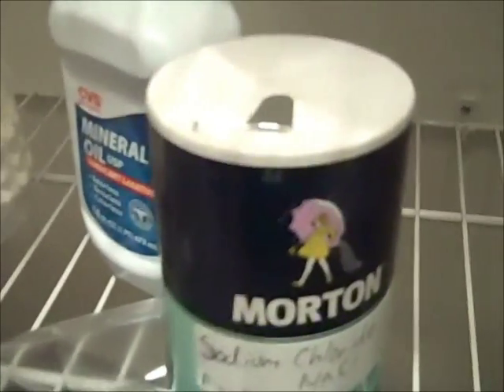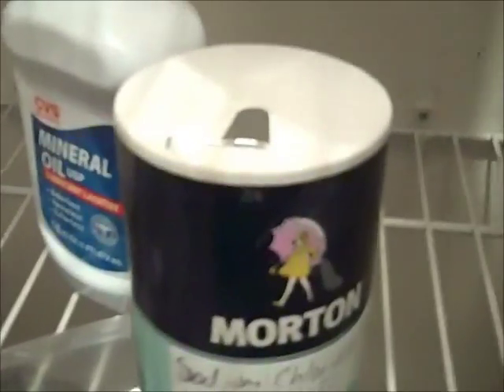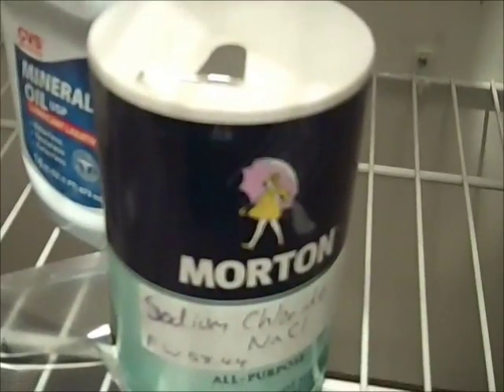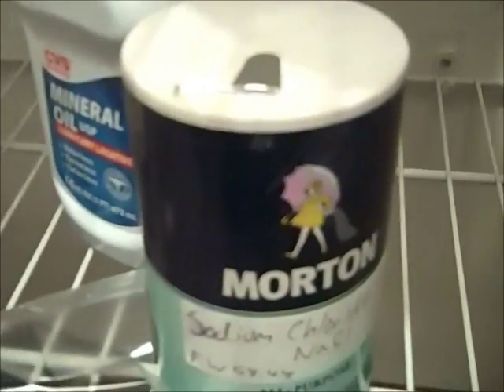Here is some sodium acetate. I made this from mixing baking soda and the cleaning vinegar I discussed earlier, which is more pure than regular vinegar. I keep it in a glass jar. And here is sodium chloride — regular table salt. You can get it at almost any grocery store or pharmacy. It's best if you get the non-iodized kind because that doesn't have the impurities associated with the potassium iodide.